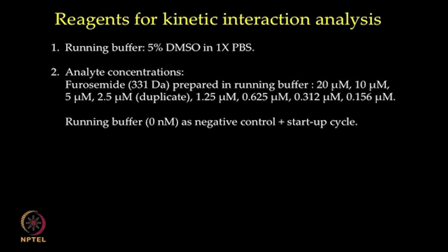Running buffer will be used as a zero concentration negative control as well as in startup cycles. A wash solution is prepared with 50% DMSO in water.